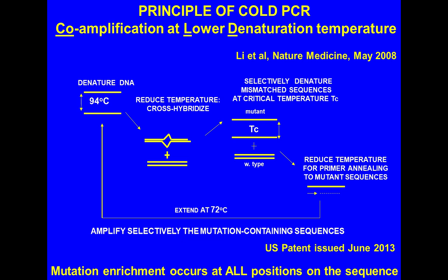At the hybridization temperature of, say, 70 degrees, the top and bottom strands will bind, and if you have mutant, that is more likely to hybridize with wild-type DNA because this is in excess, and then you create a small bubble. And this bubble contains mutant on one side and wild type on the bottom strand. And you also create a lot of wild type homoduplexes.